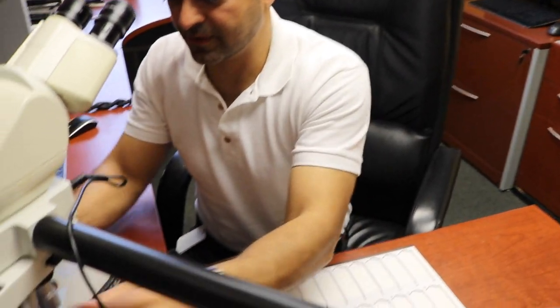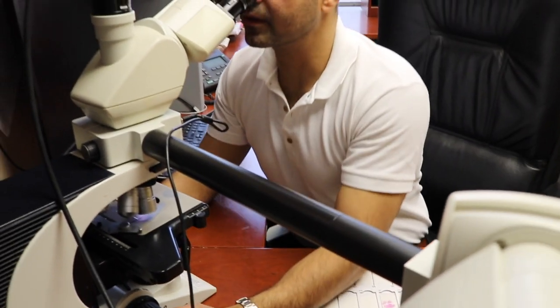This is the area of the brain that houses the neurons, and we'll try to understand some of the fundamental organization of how the neurons and the glia are organized in this pink piece of tissue. So without further ado, let's take the slide and look at it under a microscope.